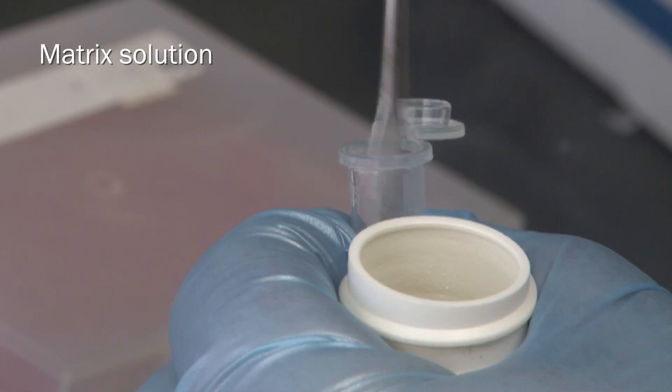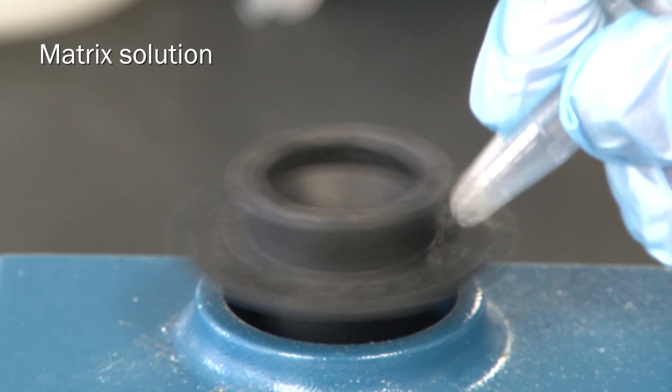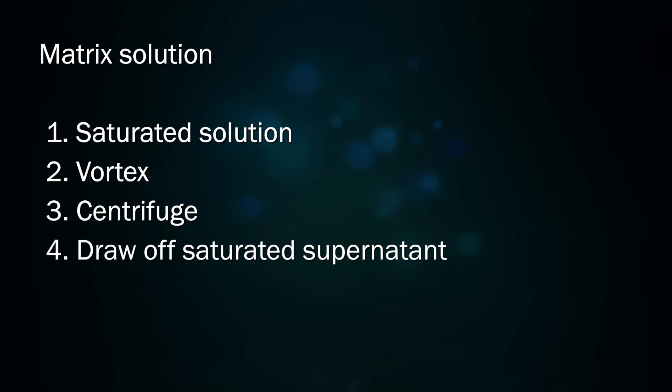Prepare a saturated solution of the matrix in an Eppendorf tube and vortex it to ensure it is fully mixed. Use a centrifuge to compact the undissolved solid and draw off the saturated supernatant into a new Eppendorf tube. Label this your matrix solution.